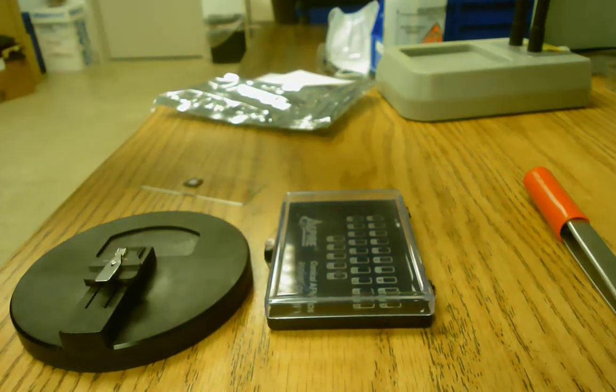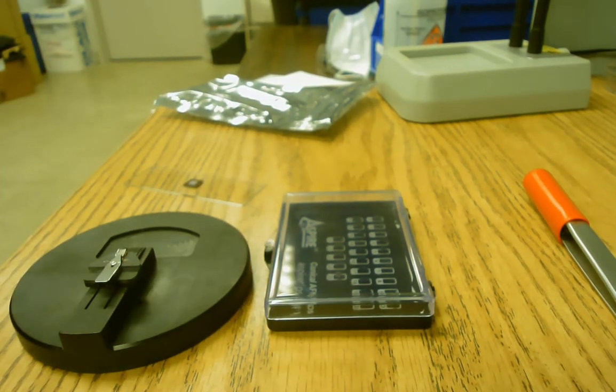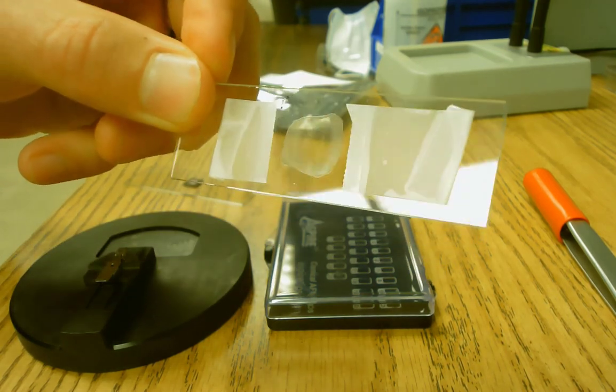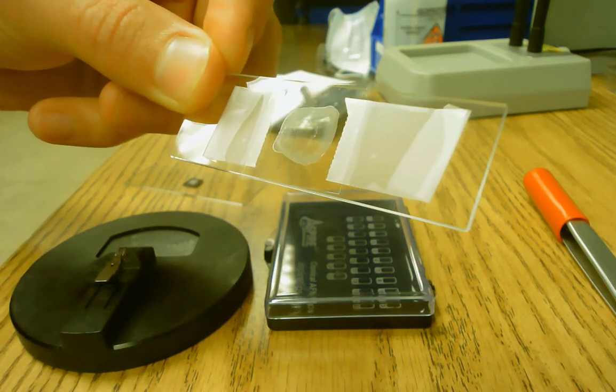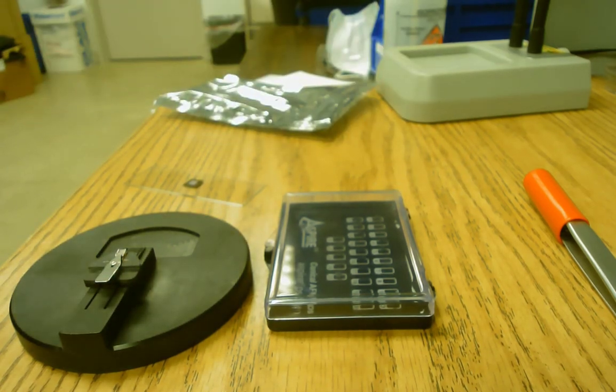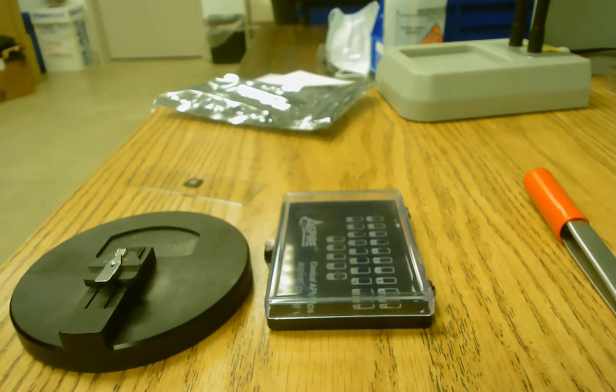And then we're going to image a sample from one of our chemistry classes, which is silver nanoparticles just dried onto a slide. And then we will image that and see the shape and morphology of the silver on the surface.